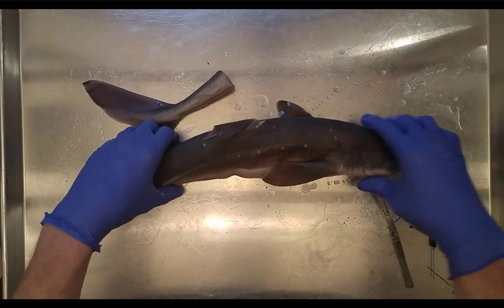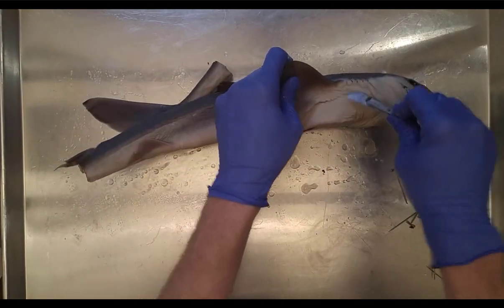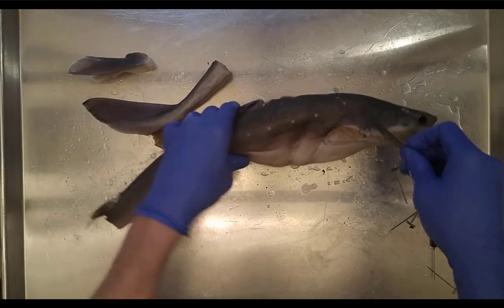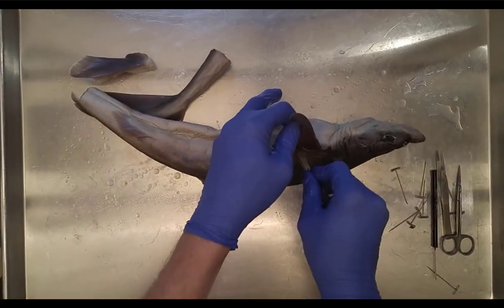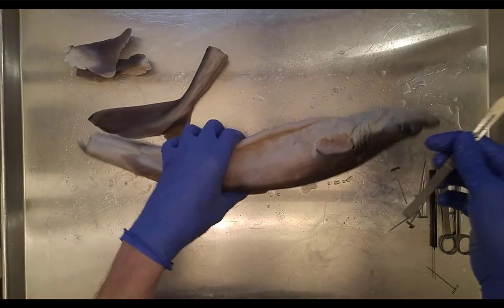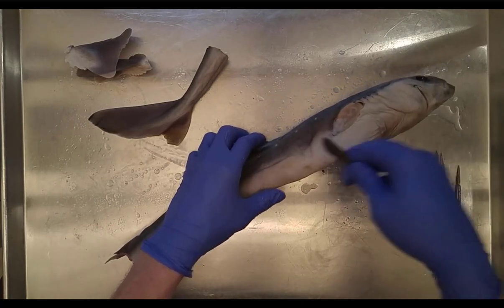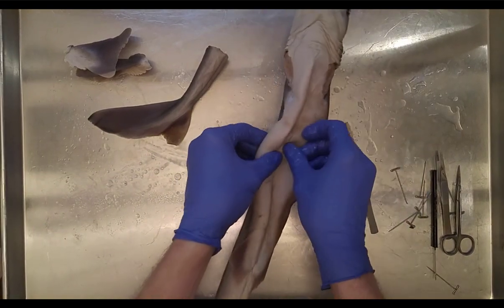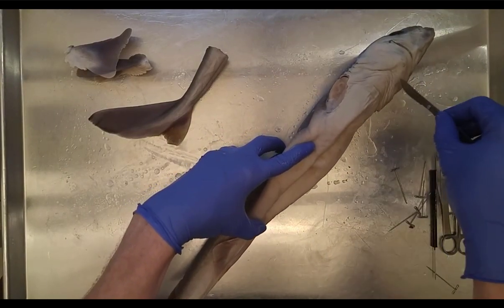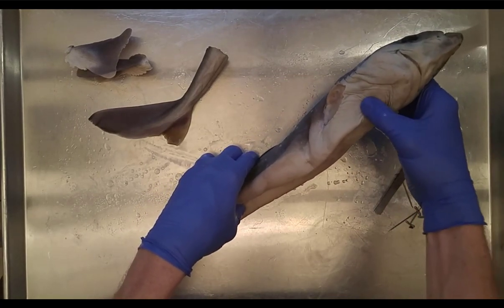Now let's open this specimen up. It helps to remove the fins first to get them out of the way. Sharks have tough skin with a layer of muscle underneath, so you have to go for it, but don't go too deep or you'll damage the organs. We want to expose all the internal organs, which will be in a variable state depending on preservation.